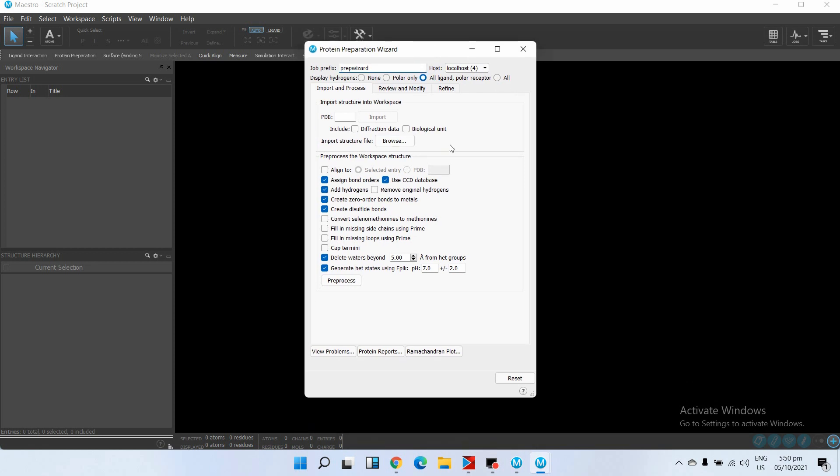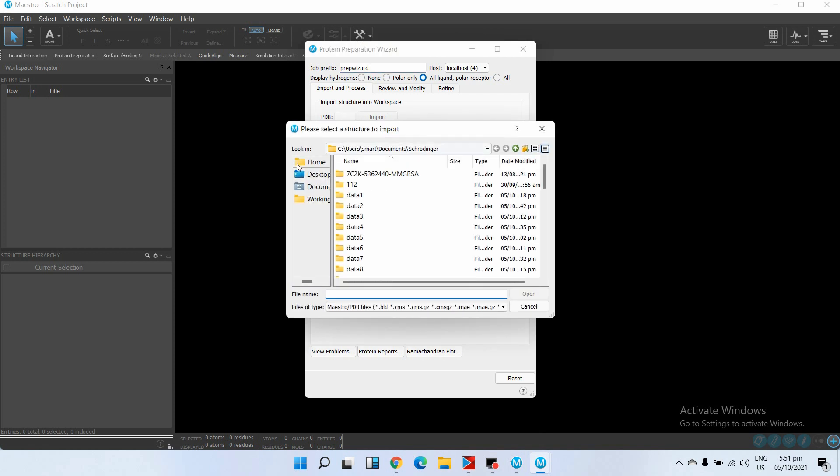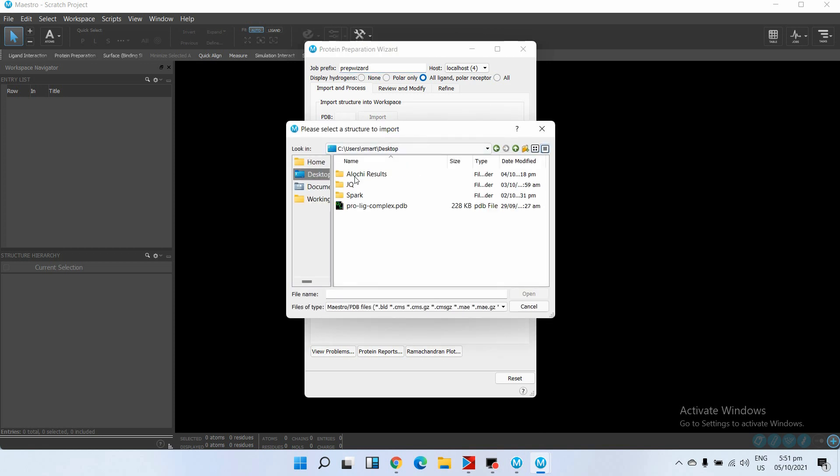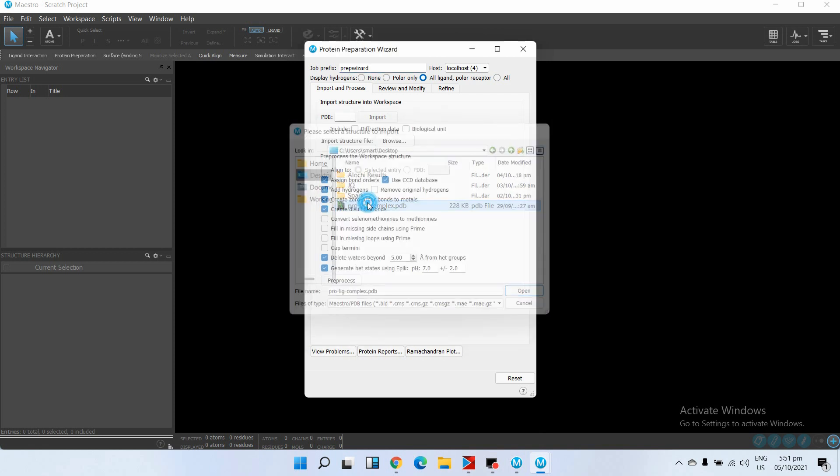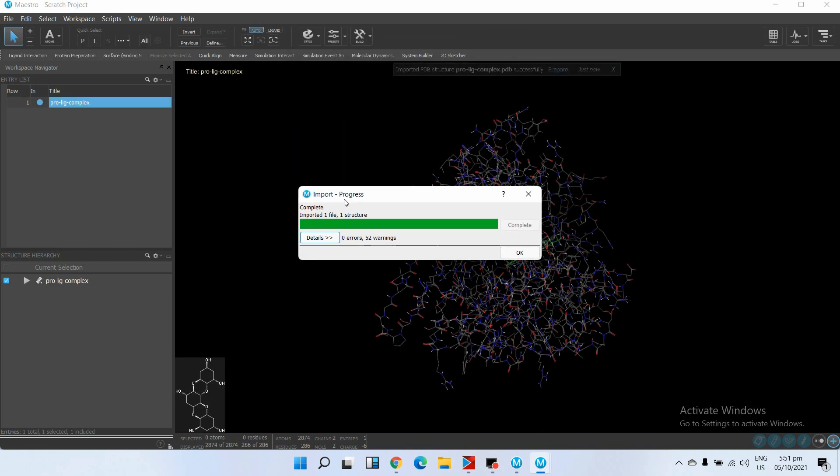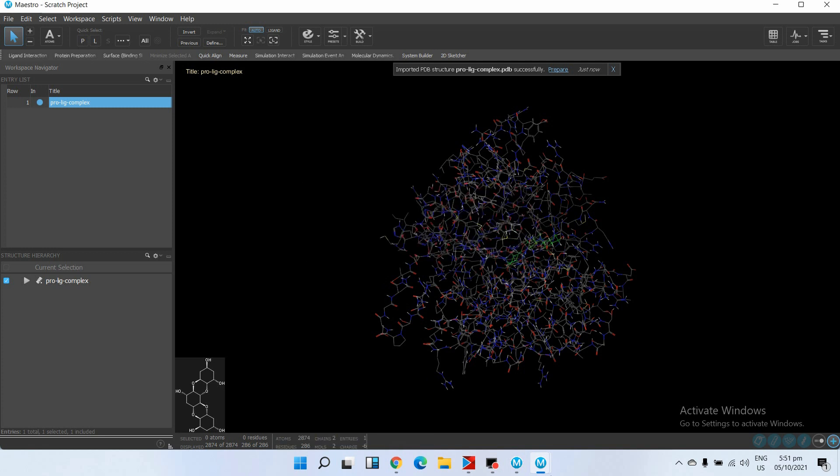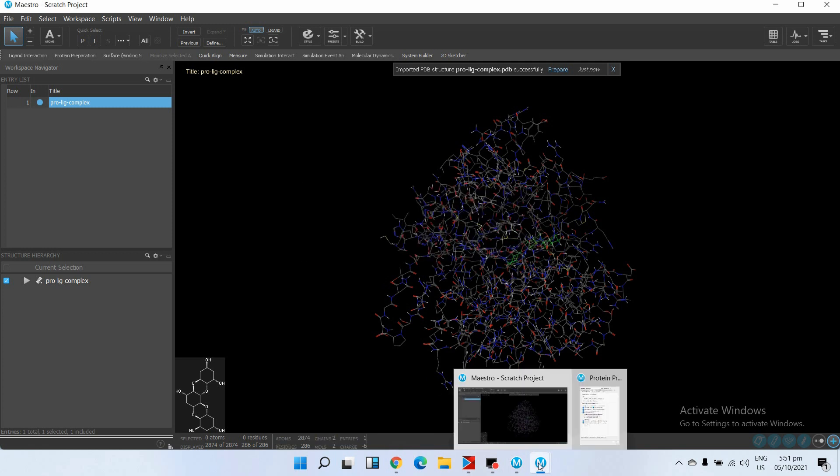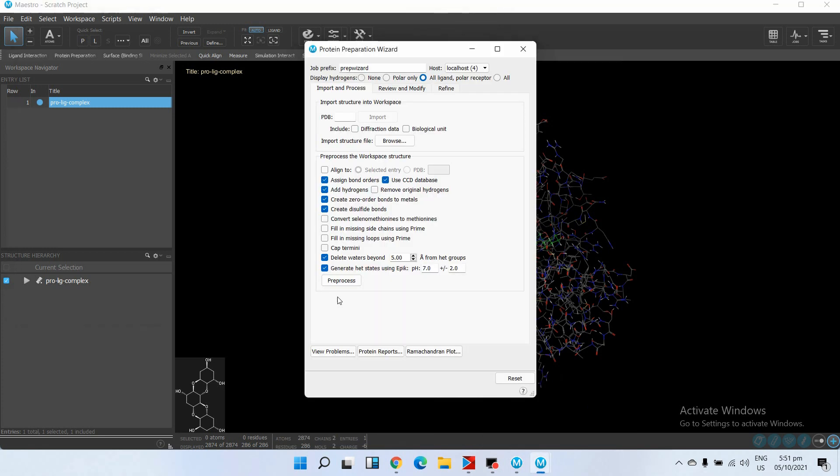Here are different options. First of all we will browse our complex. It will show you different warnings but at this step don't worry about these warnings - just click on OK.